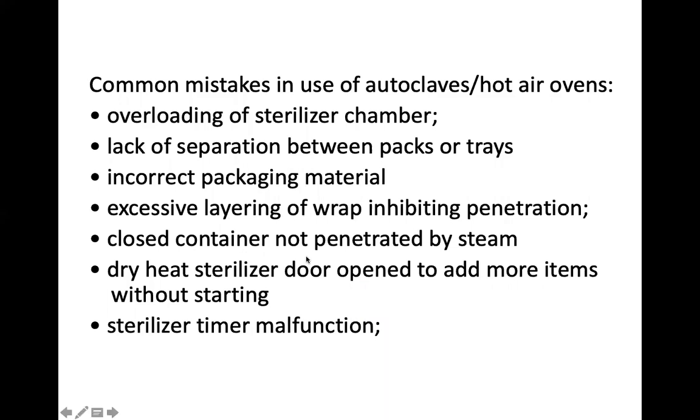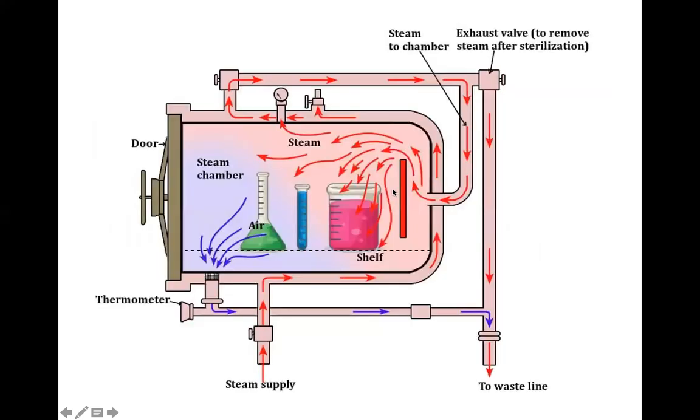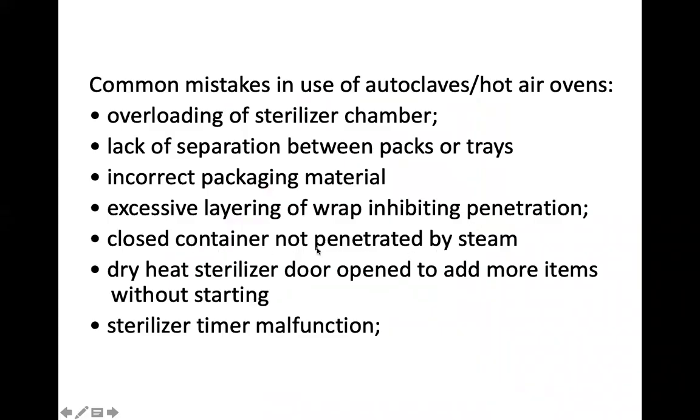Closed container not penetrated by steam. Here I'm talking about liquids. Agar here should be in a container. If there's a sealant here, it should not be completely or tightly closed, because the steam should be able to get in, all right, to heat up that liquid. So do not completely seal. Closed container not penetrated by steam, it can be, all right.